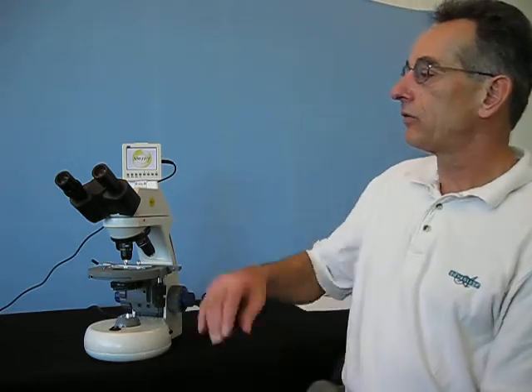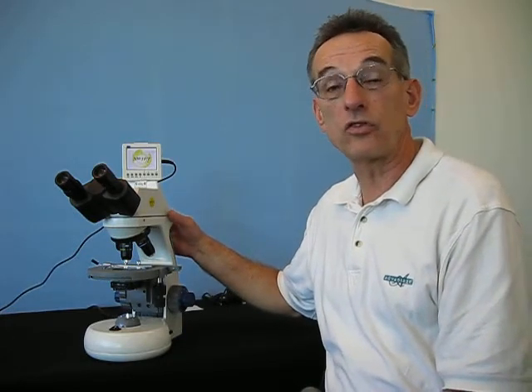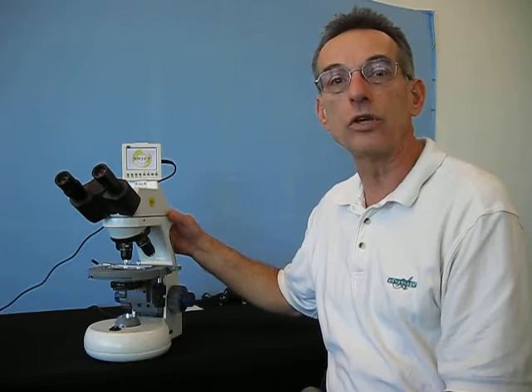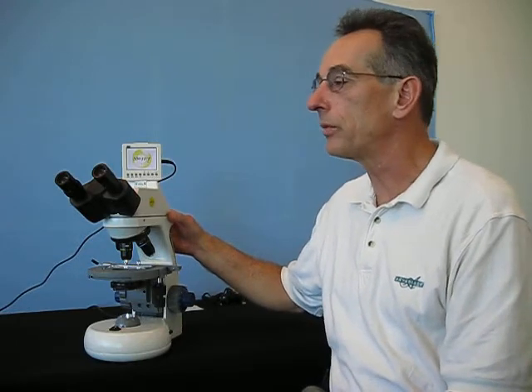Hello, I'd like to provide a brief orientation to your new Swift M10LB microscope. It's a very fine instrument and one that I hope you use well and learn a lot from. To make the instrument perform as it's designed, there are some adjustments that you will need to do to set it up for your eyes and the way you use the microscope.